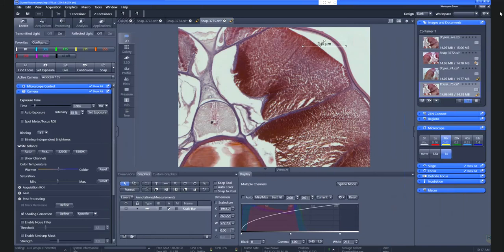Okay, talking about saving that image, if you would plainly save this image, you would stay with the CZI image format, which is a generic format, which allows us to handle lots of different things over a session, like Z positions, like positions in our samples, like different channels. If we talk about multi-channel fluorescent images, it allows to cope with time series and everything. And we somehow handle raw data in the back. So we never process automatically our data. You can be sure you can trust your data. So best is always to keep your CZI file, as we can see here. It's a certain file format.